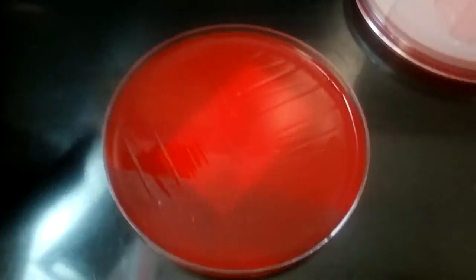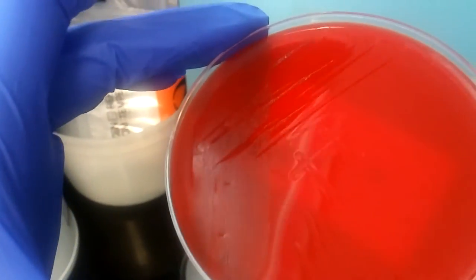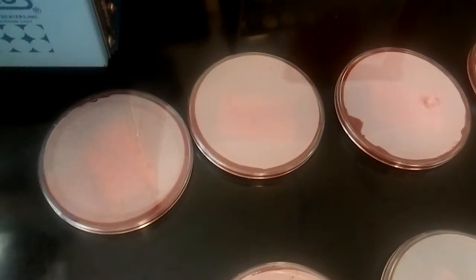These are what the strep screen cultures are growing so far. So you can barely kind of see a little bit of stuff growing. Not too many defined colonies yet.